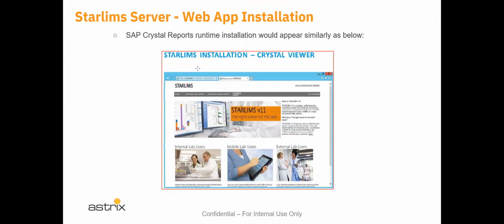Towards the end of the installation, you'll get a prompt to install the Crystal Report runtime engine. And even though they call it Crystal Viewer up here, it's actually the runtime engine.